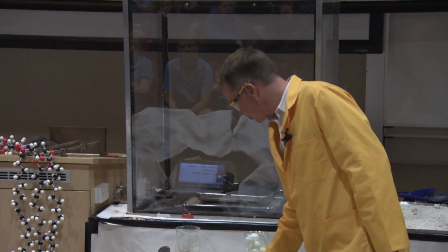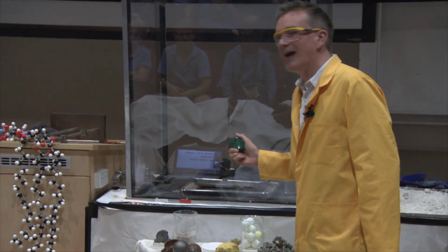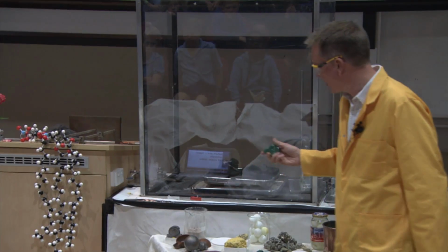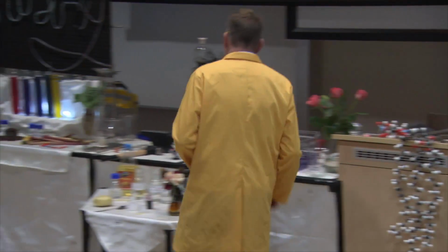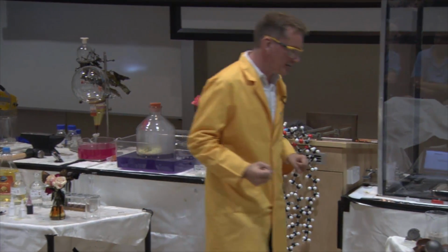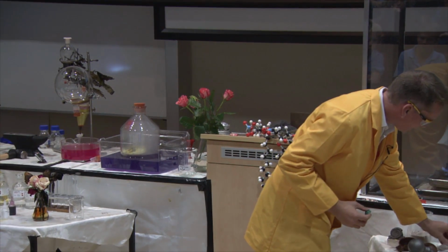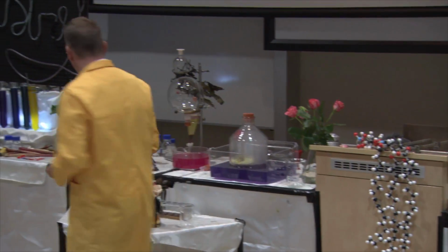For instance, some of these minerals react with acid, such as this beautiful green mineral here. Well, this is called malachite, and it's a copper carbonate. It's a type of copper carbonate here. And a test for carbonates is, if we add some acid to these, they should bubble. So let's try this. Let's take a piece of our malachite here. And we'll see if this really is a carbonate. I'm going to smash it up using my handy anvil.